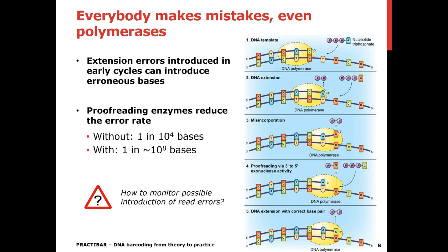They have a sequence which you know, and they have the primer sites on it as well. So every time you do an amplification, you also do the amplification on a gBlock. And by sequencing those amplicons, you can find out if there are errors introduced, because you know what the sequence should be. So it's always good to use an amplification control.